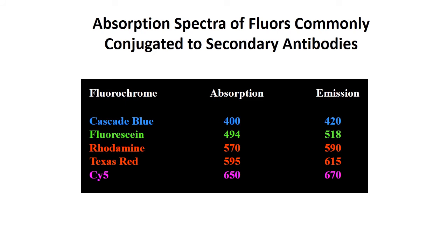So the same specimen could be labeled by using different types of fluorochromes, and upon excitation with a suitable wavelength of light, it is going to produce a particular type of fluorescence. In this manner, if we label different regions of the cell by different fluorochromes, we can obtain individual images showing those different parts of the cell.